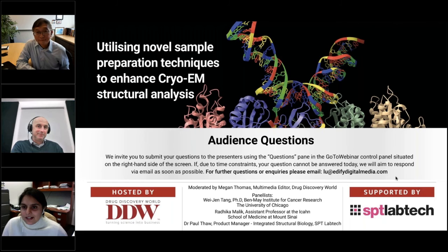I can take first. So the sample is very important, as Wei-Jen said. The quality of your sample and the integrity of your sample is very important. I mean, during the Vitrobot process, as you would know, the sample has a tendency to get damaged.